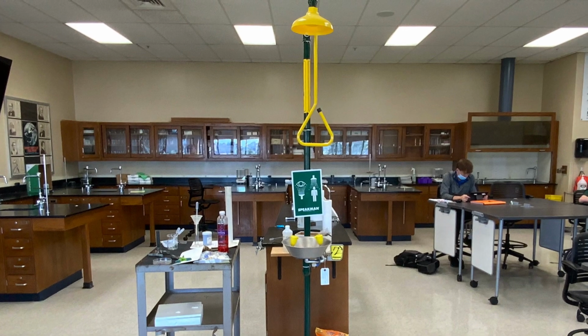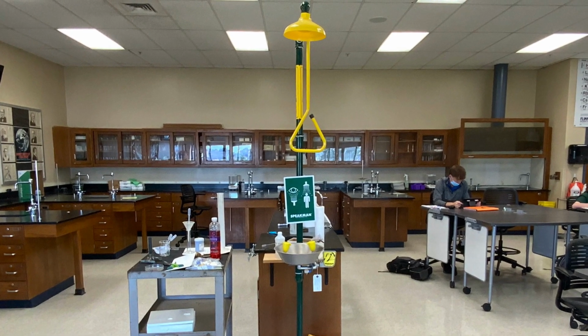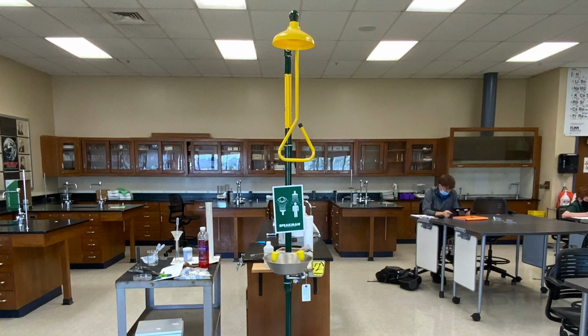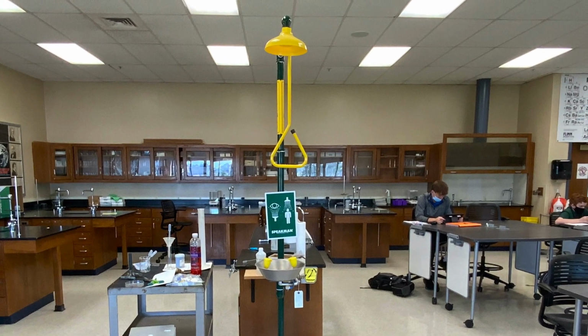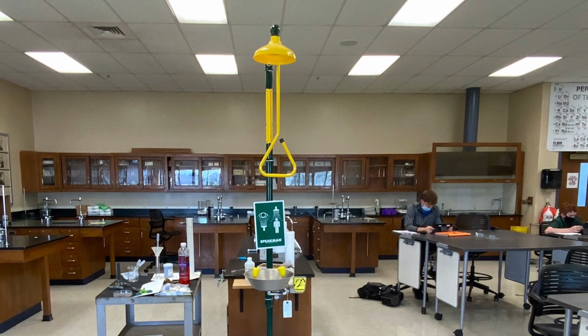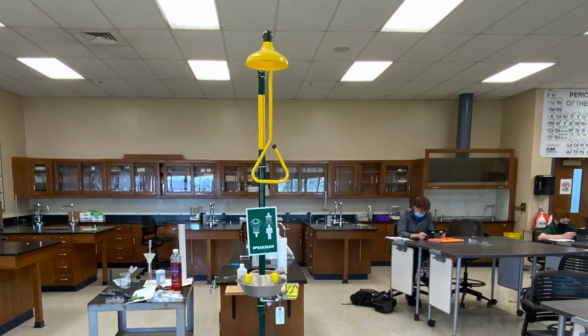Photographed here is the chemical shower station. This is to be used if at any point someone catches on fire, or a part of their clothes catches on fire, or something happens where they need water to be put on them or their clothing. You go to the chemical shower station and you just pull on the lever and water will come out. Now, obviously, there's not a drain below it, so this is only to be used in emergency situations.